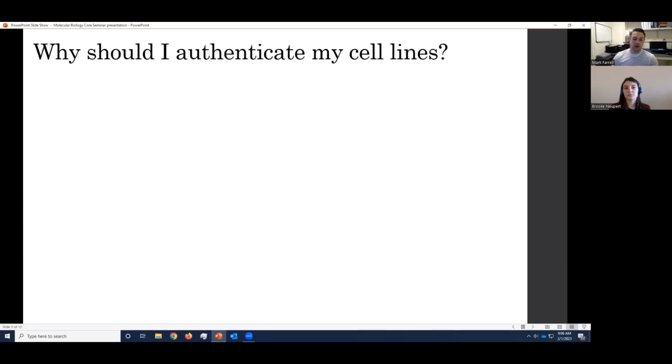So the bulk of my presentation is going to be about our cell line authentication service, because I think fewer people know what it is, and fewer people know how important it is than some of our other services. So that's what I'm going to be spending the next few slides on.